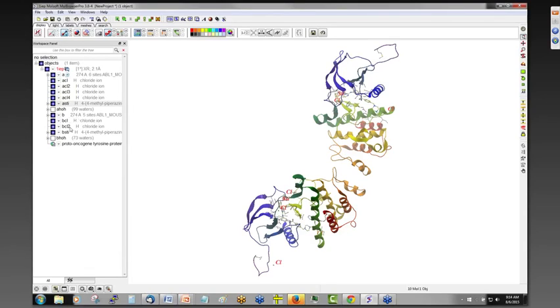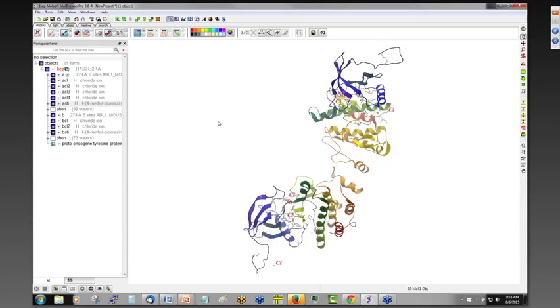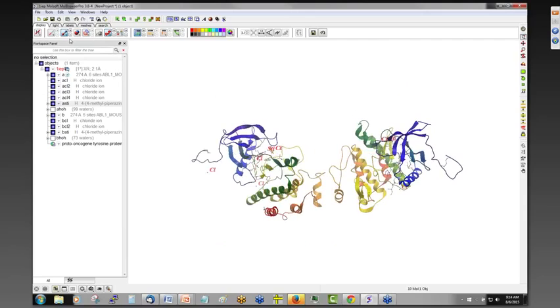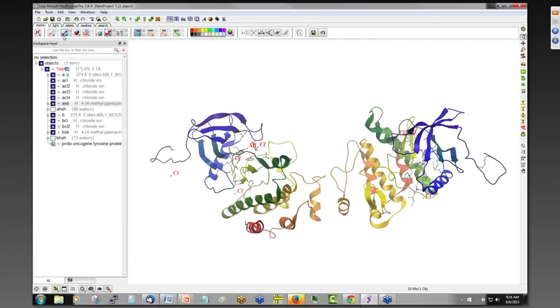And in the B chain, it's the same. And at the end, we have all the water molecules grouped together here. So we may want to just make a clearer image of this structure. So I'm just going to remove all the labeling.